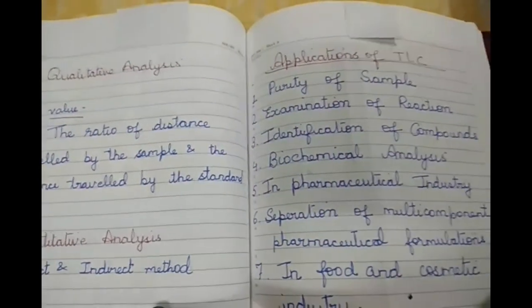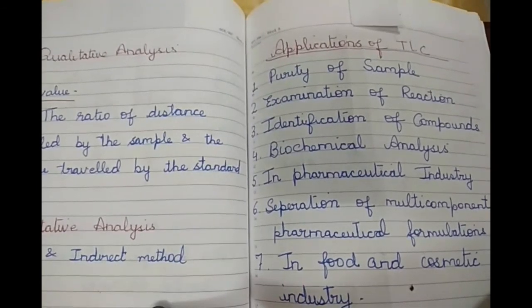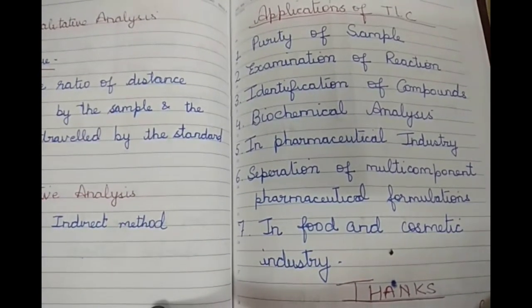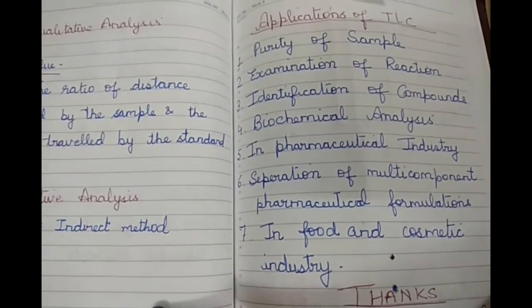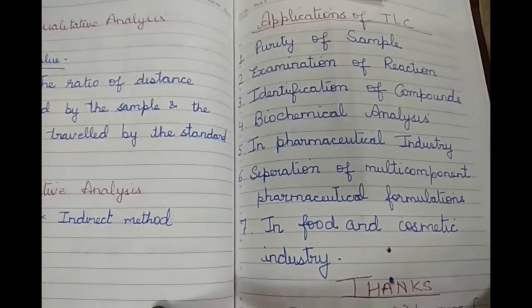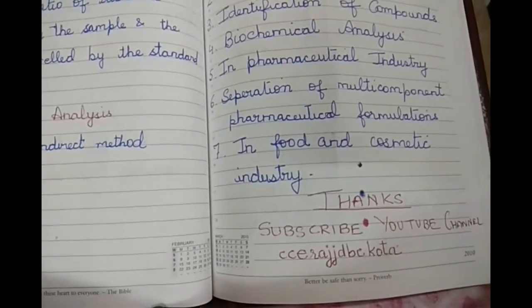Now the applications of TLC. First, to check the purity of a sample. Second, examination of a reaction. Third, identification of compounds. Fourth, biochemical analysis can be done. Then we have TLC finds great use in pharmaceutical industry. Then separation of multi-component pharmaceutical formulations. And last and the final is in food and cosmetic industry.